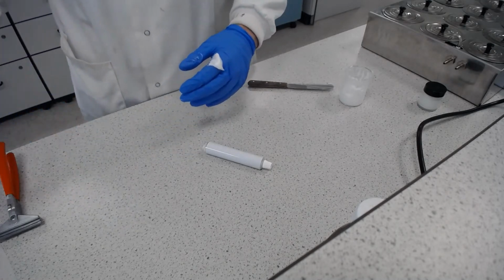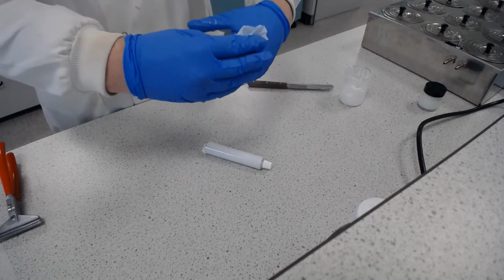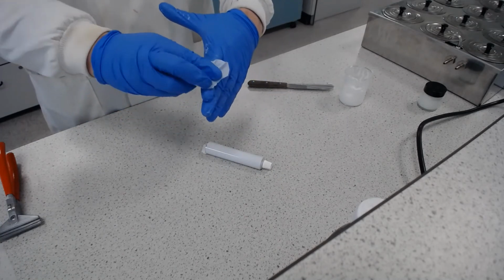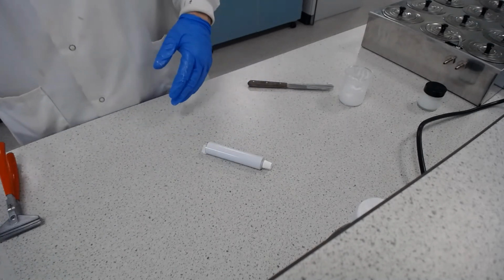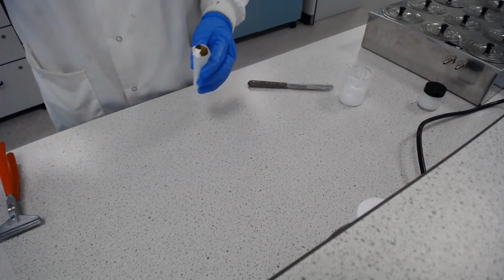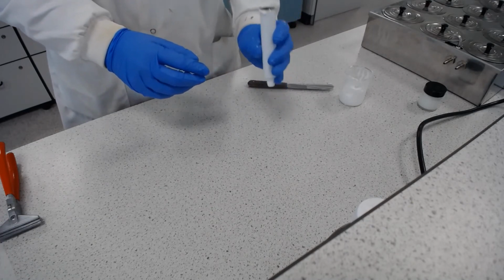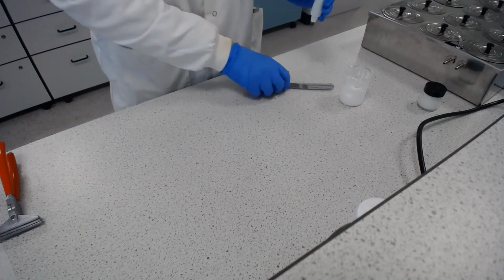Like so. And I probably put a little bit too much in there because I've got some of that on my hand. So you could just change your gloves or something. I'm just going to wipe that off. And I've got a bit on the desk as well. So you can then just shake that down into the bottom.